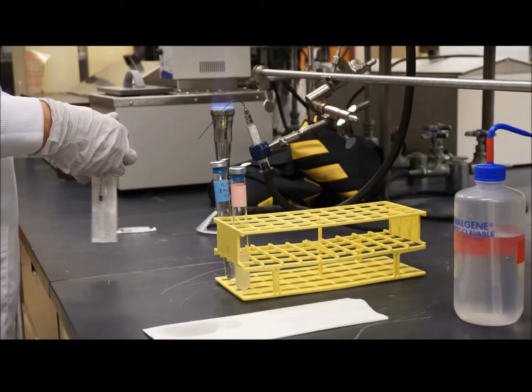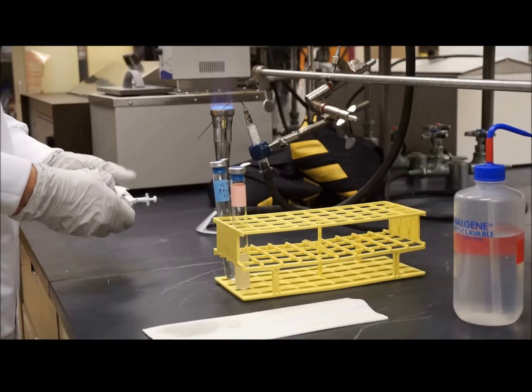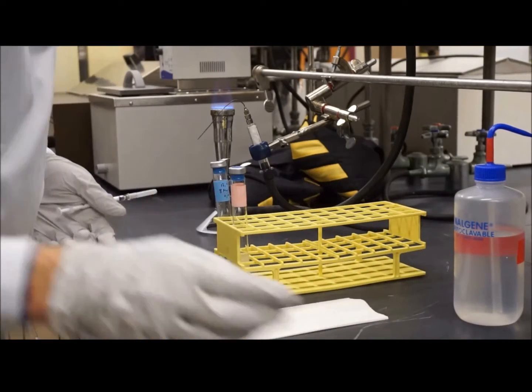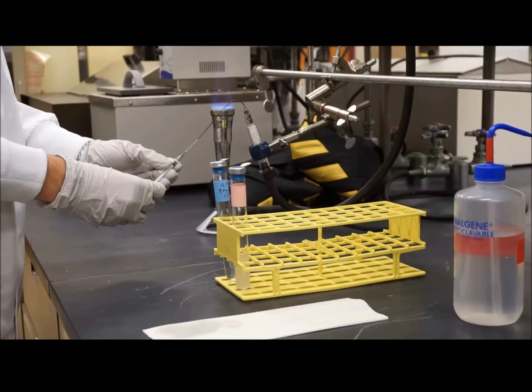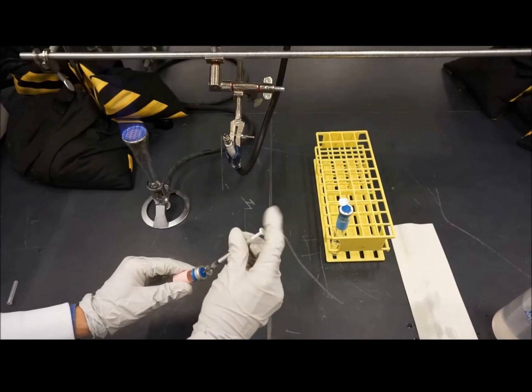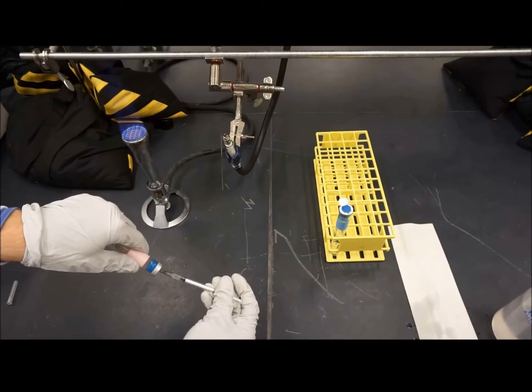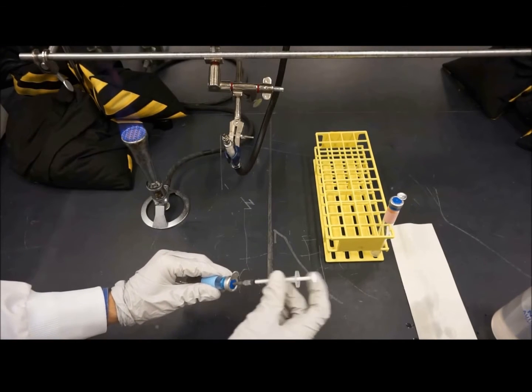Now we're ready for our syringe. We attach a needle to the syringe aseptically. In order to flush out trace amounts of residual air, we must flush out the syringe with CO2 by inserting into the gassing probe and pulling the plunger in and out. We pierce the tube with the old culture, which has a pink label. We withdraw a small volume, about 0.1 milliliters. We take the tube of new media and inject the culture using the syringe.